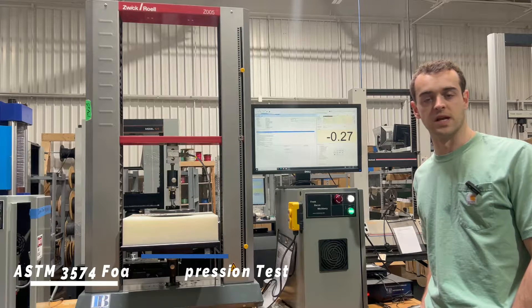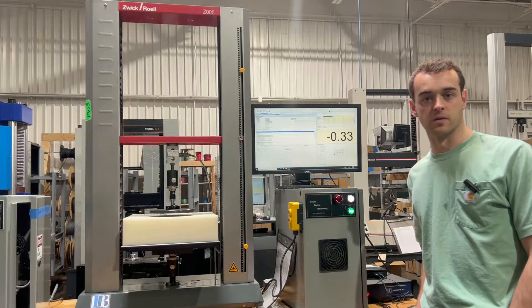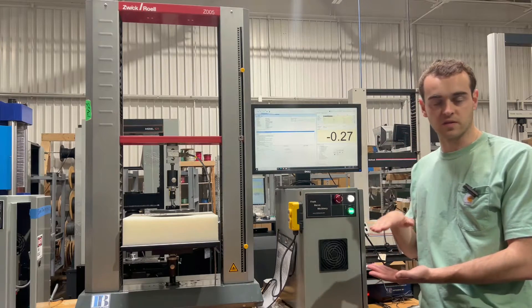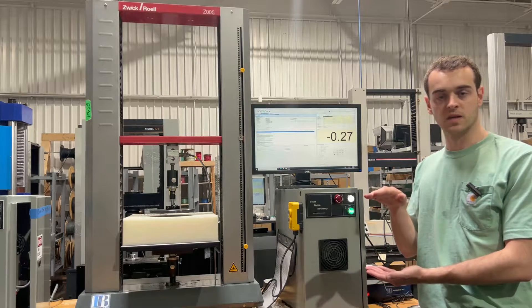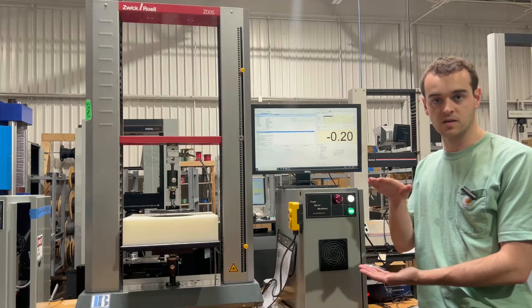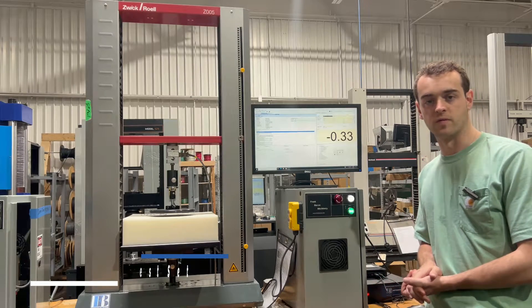It's a little bit more detailed of a profile than a lot of customers would be able to write on their own. This ASTM calls out compressing the foam sample to 75% deflection twice, allowing it to rest for 6 minutes, and then running again and taking loads at 25% deflection as well as 65% deflection, all in the same profile.